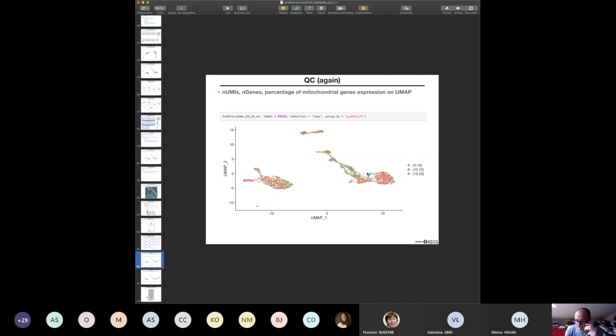That's where the discussion with the biologist will help to continue the analysis. Like, I can't find any specific markers for these cells. Can you think of something? I should go and look in the data to be sure these are cells and not dying cells or debris, and we can try to find a solution.